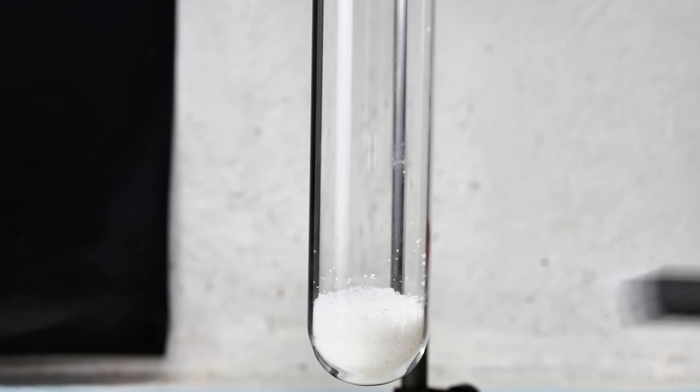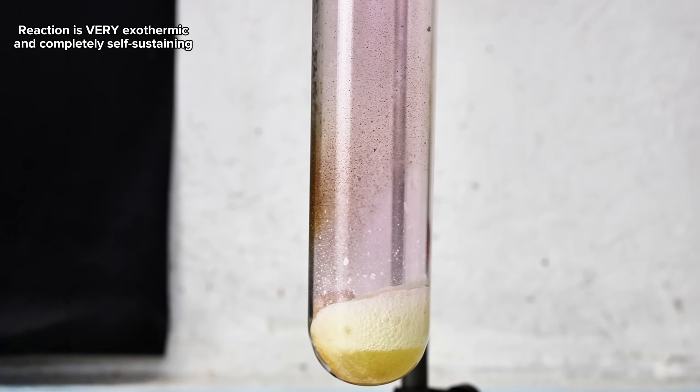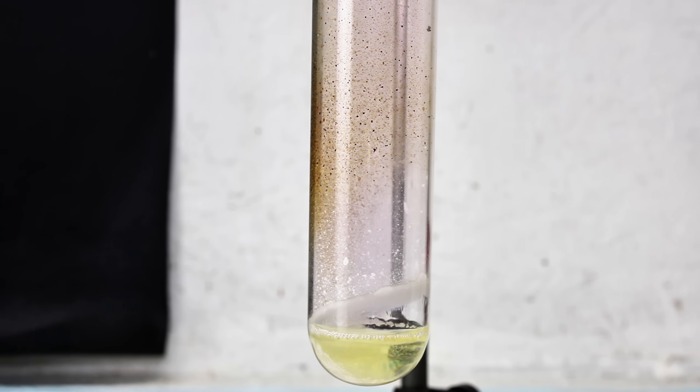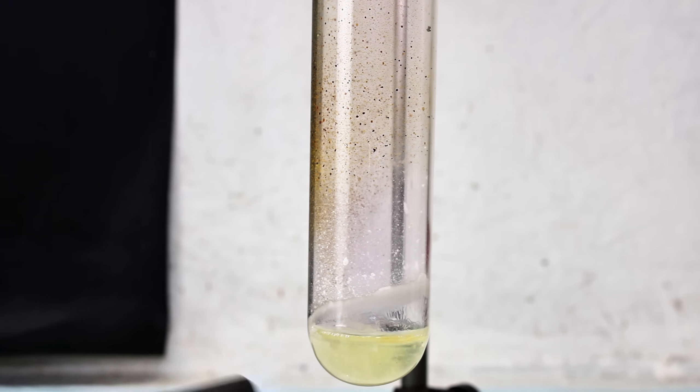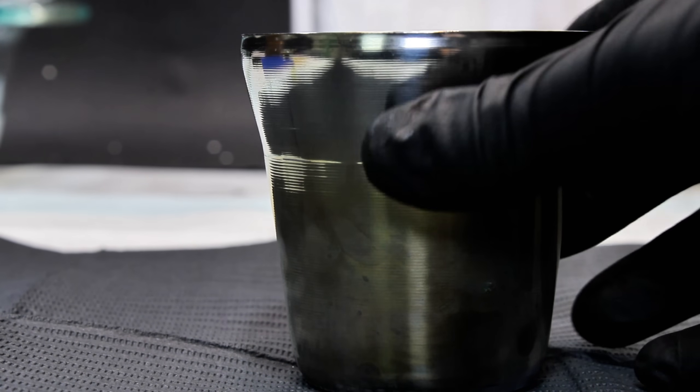When the bromate and the iodide are melted together, they'll react to form bromide and iodate. In the test tube, you can see that the heat from the Bunsen burner acts more as a catalyzing activation energy for what's clearly a very exothermic and easily self-sustaining reaction. This reaction also generated some iodine vapor as a byproduct, which was much more noticeable in the larger scale reaction I did first.